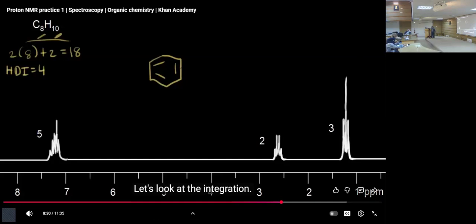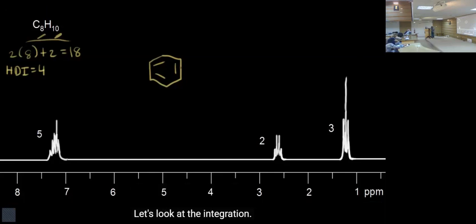Most often when we report the hydrogen deficiency index, we calculate it at the end when we already have the structure, when we are writing the manuscript. That's the usual practice in natural product chemistry. So looking at this structure, we do not need to go back and calculate with the formula. We can immediately look at the structure. Whenever there is a ring, there is 1, plus the number of double bonds there.